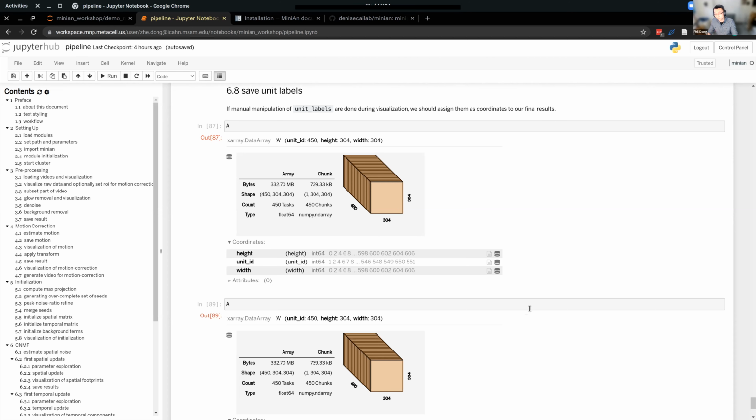We basically have to duplicate the notebook and communicate with it for it to run. That's kind of hard. So that's the status right now. If I see a better option for batch running notebooks, I may implement that. But other than that, I'll just copy it into a for loop.